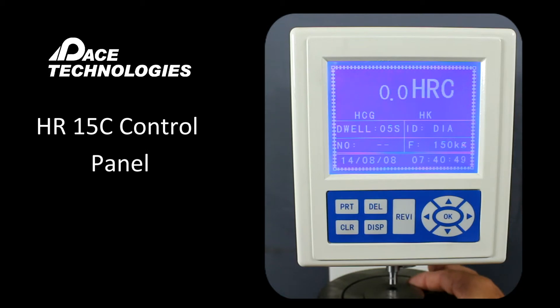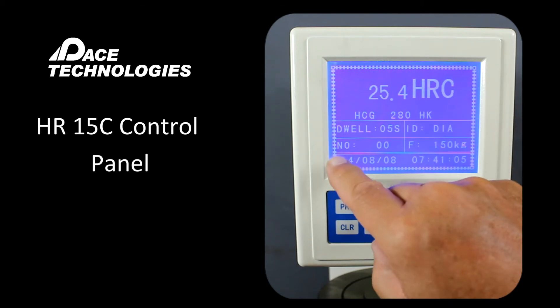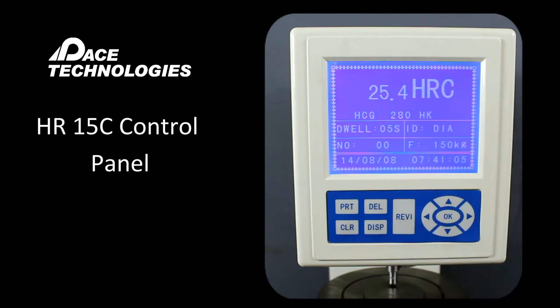Let's go ahead and make a quick measurement here. You'll see that this will count up to a value of 580, and then there will be a little chirp — that's when you stop applying the load through the screw. At this point the minor load is being applied, then it will convert over to the major load, and you'll see the dwell time count down to zero. When it chirps again, this is showing you the value. You can see that we have number zero here, so if we tried to print we wouldn't print anything or have anything displayed.